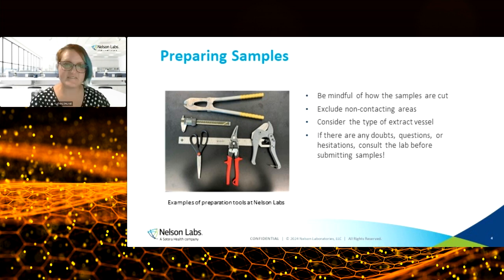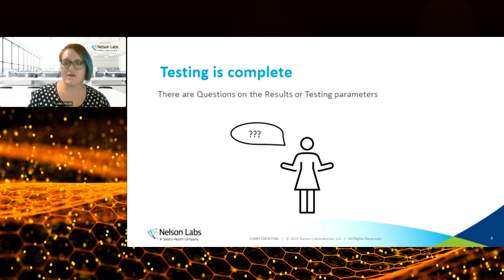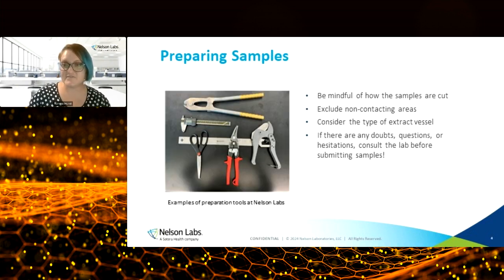Yeah, I had one other example where a stainless steel device was failing cytotoxicity because it was being cut. When stainless steels are passivated, it creates a layer on the outside, but once you cut it, you're exposing stainless steel that hasn't been passivated. That was part of their issue, something you wouldn't expect, but it happens. So definitely something to be aware of. Yep. Thanks, Katie.